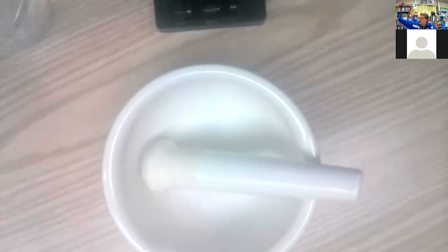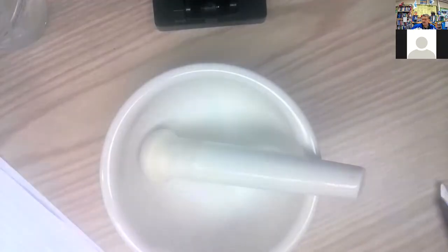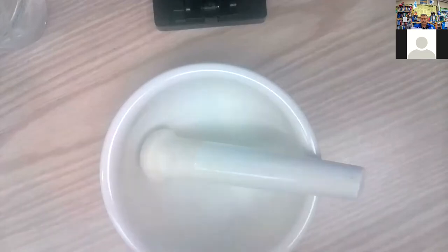Let's see. I'm gonna get some paper out. And, you know, in a laboratory, you might use some fancy paper, but instead of doing that, I just need 3 pieces of paper to put the powder on when I'm done crushing it up. So now I have 4 pieces of paper.